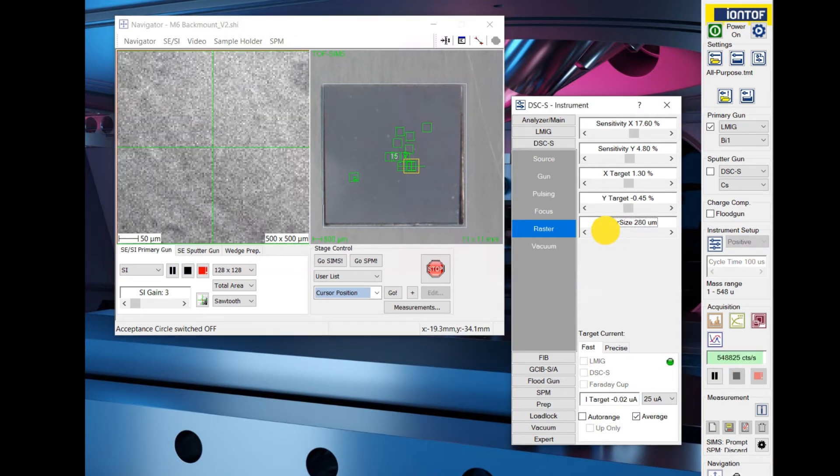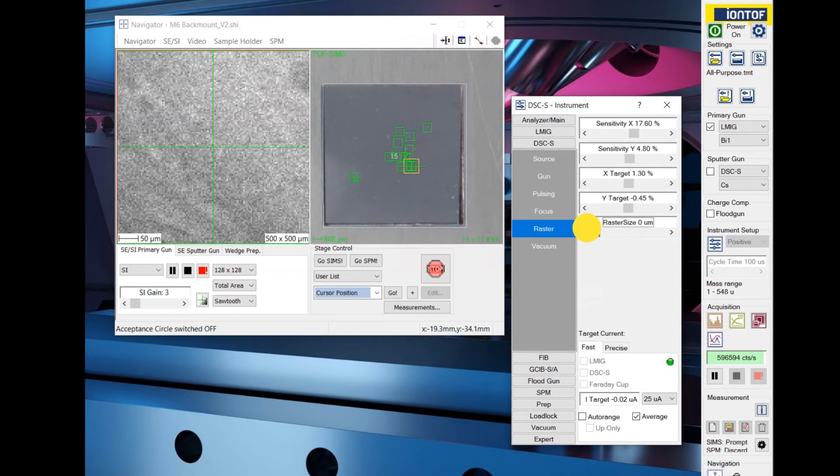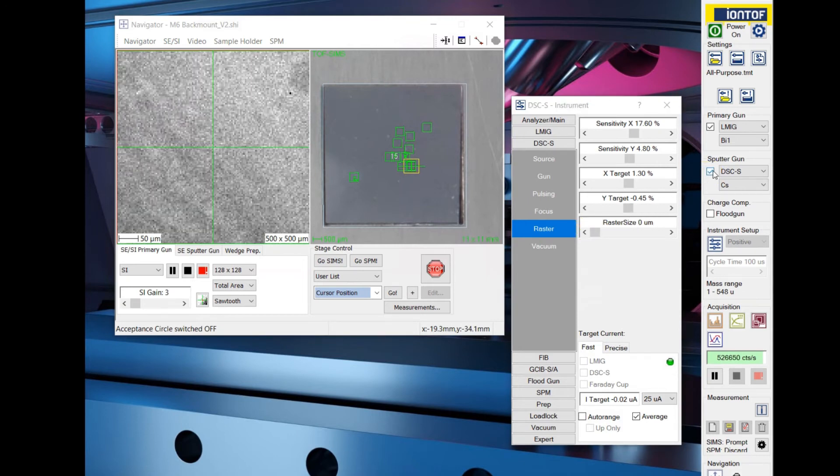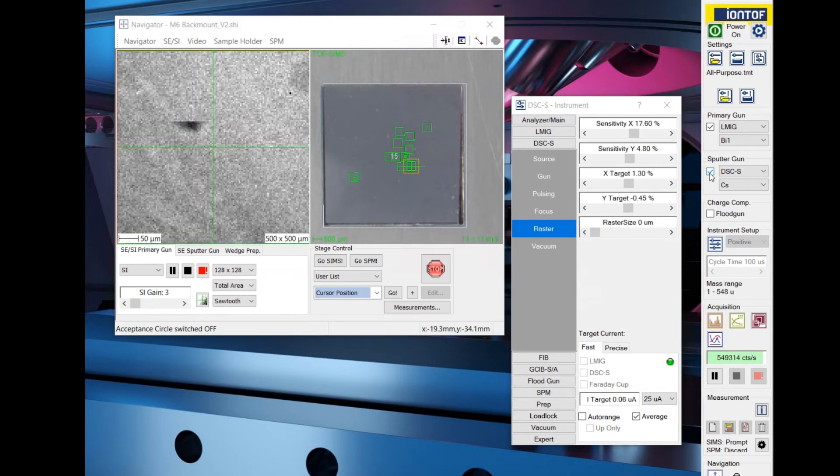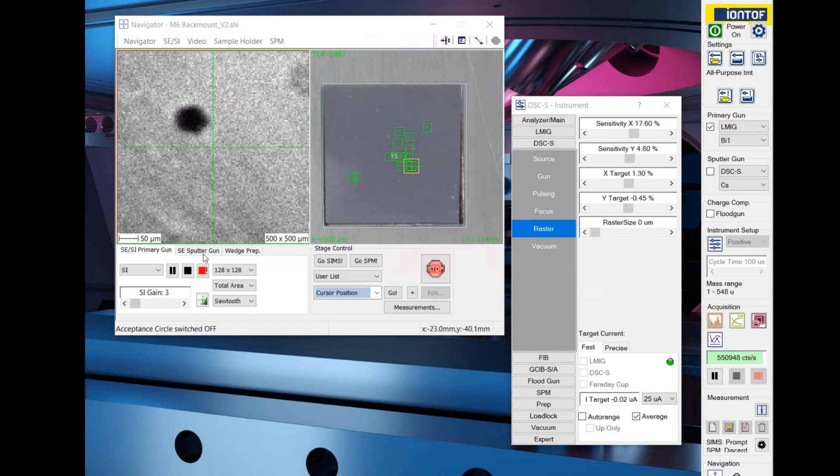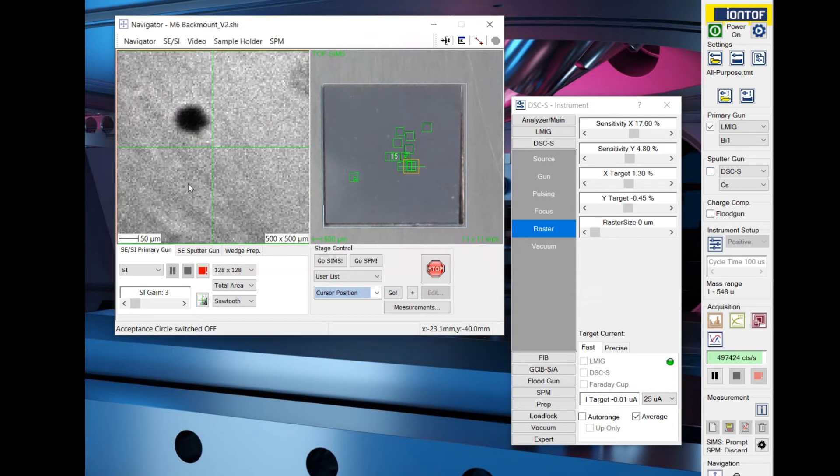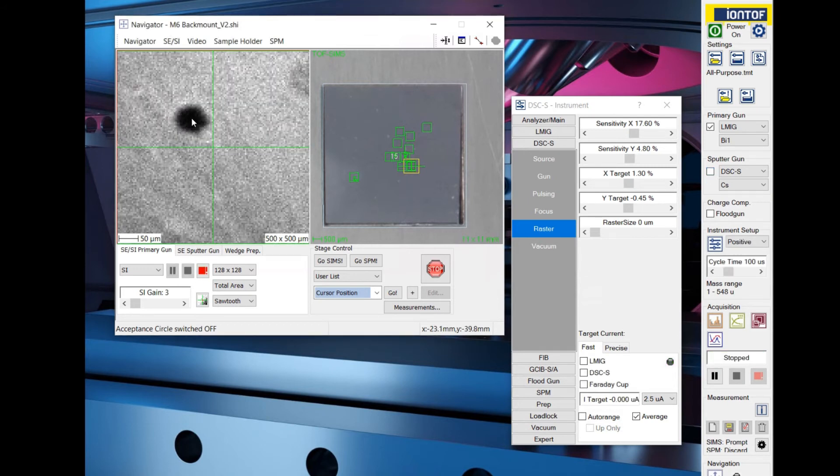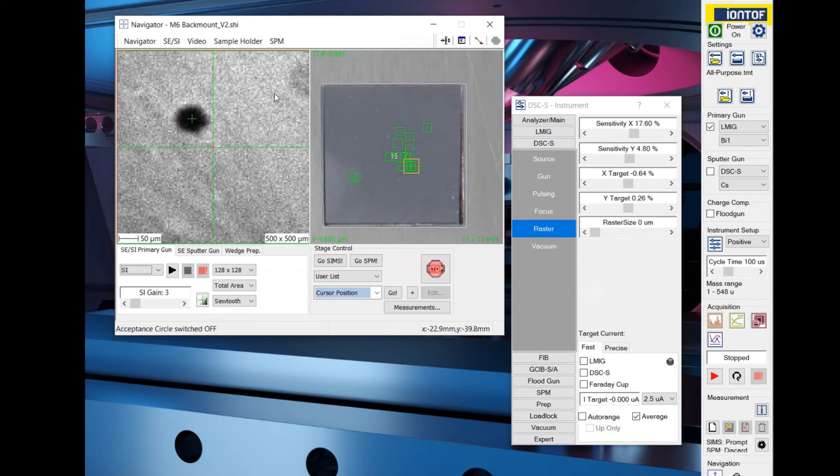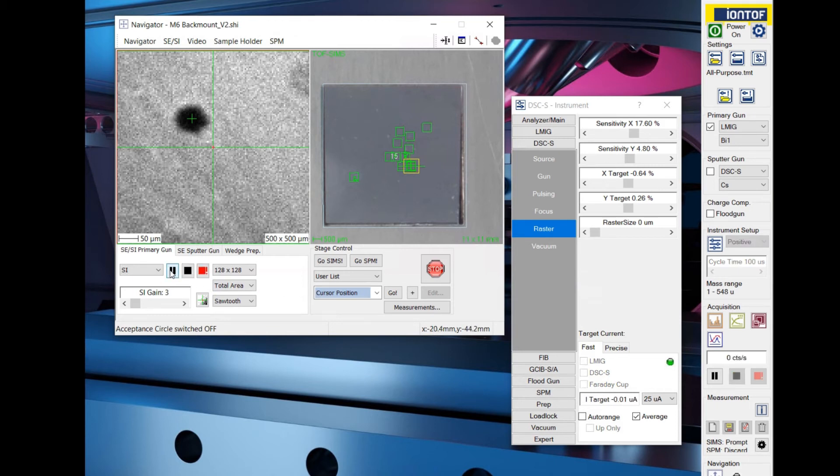Decrease the sputter raster size to 0 nm and enable the sputter gun for a short period of time to mark the position where the sputter gun impacts the sample. Left mouse click in the middle of the test shot and center the sputter raster in the navigator menu. The position of the sputter crater is now aligned with your analysis position.